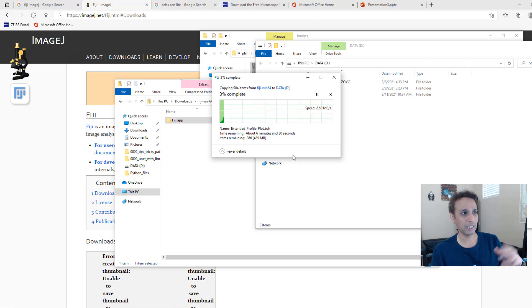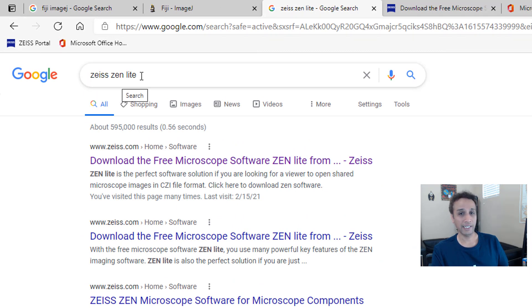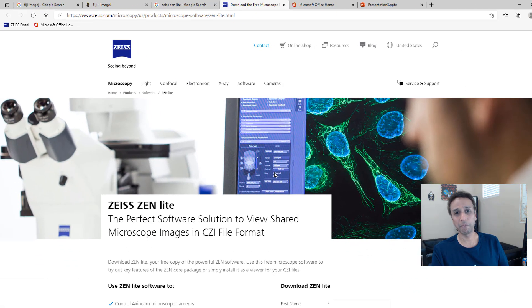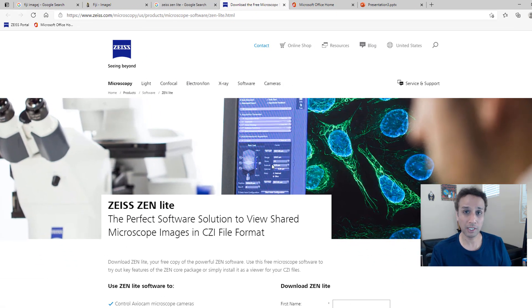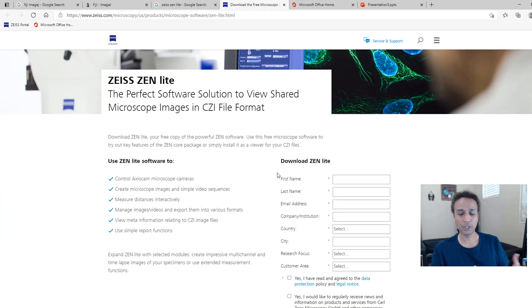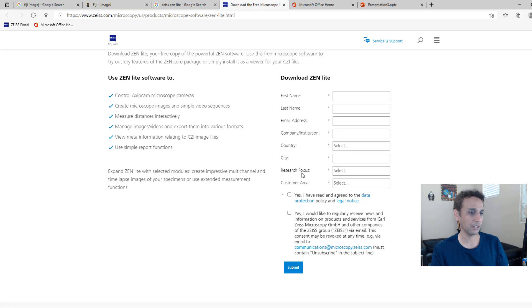While this is extracting, let's go and look at Zen. Go ahead and Google search for Zeiss Zen Lite — Z-E-N-L-I-T-E, Zen Lite. Go ahead and click on the first link. Of course, this is designed for microscopy-related applications, but it can be very useful even for non-microscopy applications. I definitely recommend it for microscopy applications, absolutely. If your images are multi-channel, multi-dimensional, you can go ahead and use it.